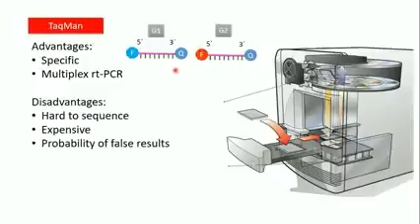We can also use a green fluorophore. We can use multiple specific detectors, or multiple TaqMans. And then this will be very specific to G1. This is specific to G2. And then if I have one DNA sample and I want to perform several real-time PCRs in one tube, I can, for several genes, use the specific detector.